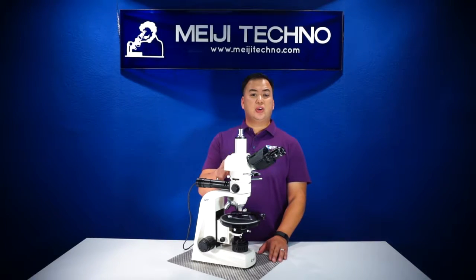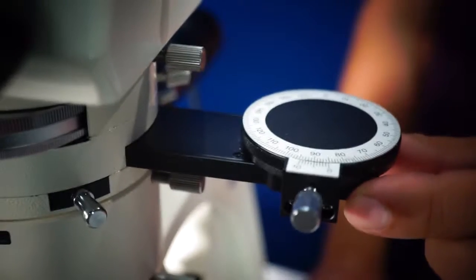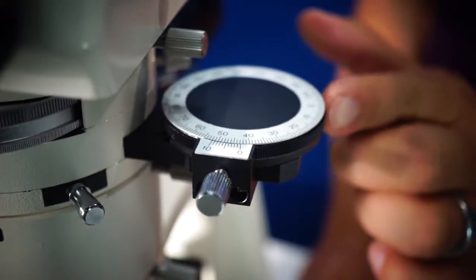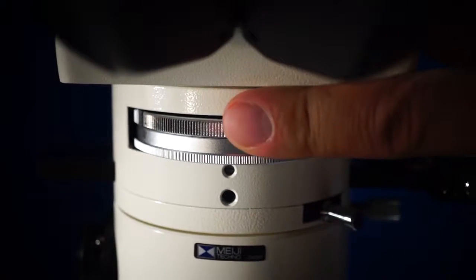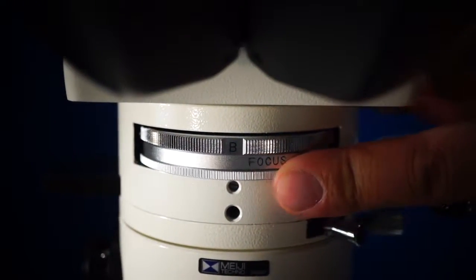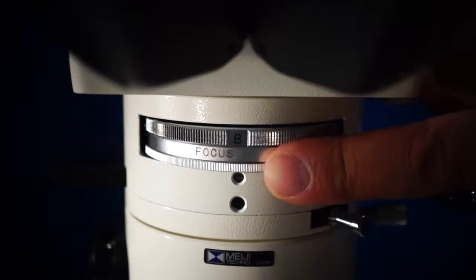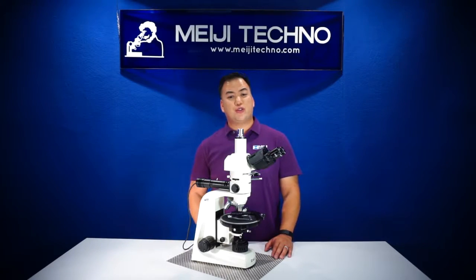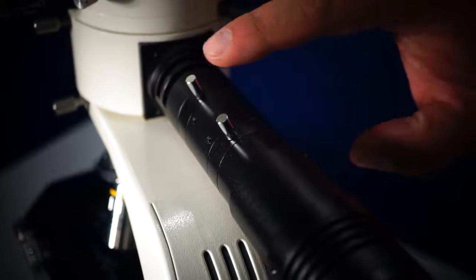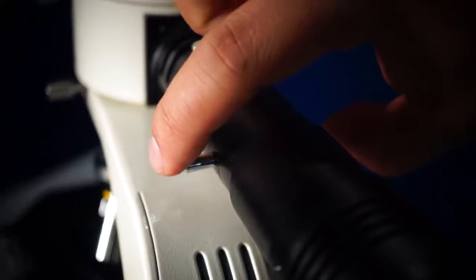Below the heads, the MT9900 is also equipped with an orthoscopic and conoscopic intermediate tube with a 360-degree rotatable analyzer and a focusable Bertrand lens. You can engage your Bertrand lens or put it in the bright field position. If you have it on the Bertrand lens, you can focus it even more, which greatly improves your interference figure quality and resolution, along with a compensator slot designed to accept thin standard compensator plates.